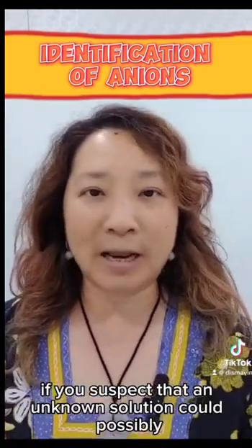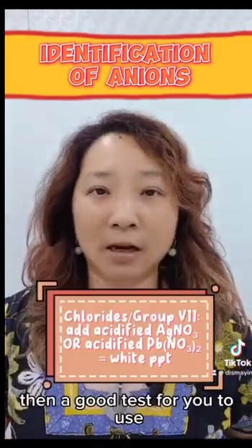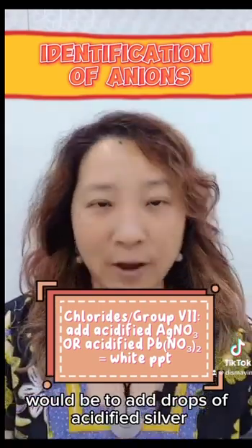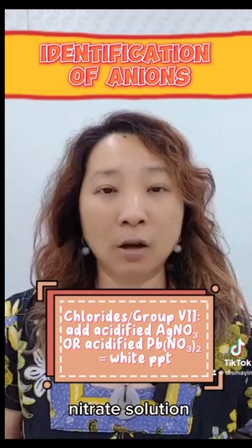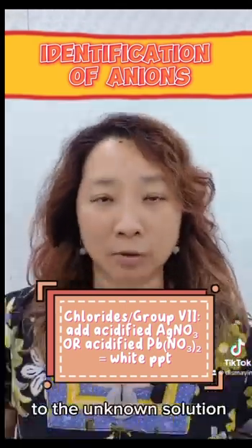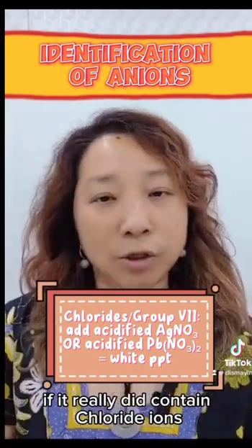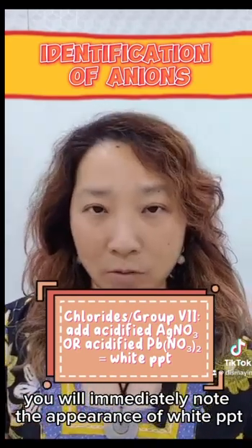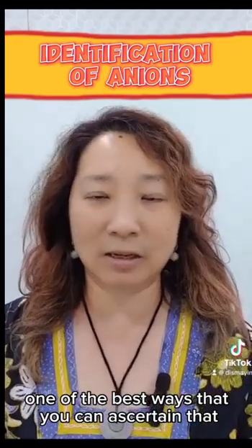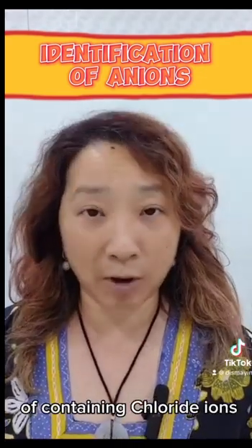For example, if you suspect that an unknown solution could possibly contain chlorides, then a good test to use would be to add drops of acidified silver nitrate solution or acidified lead(II) nitrate solution to the unknown solution. If it really did contain chloride ions, you will immediately note the appearance of a white precipitate. That will be one of the best ways that you can ascertain that your unknown solution very probably contains chloride ions.